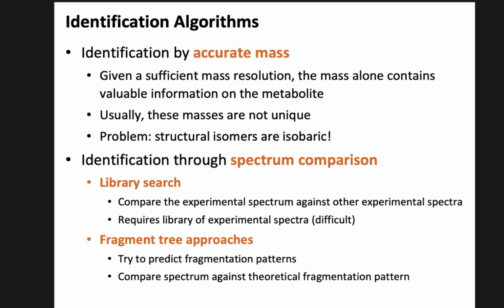And as I said, it does not mean that it's really the same compound, because these metabolite spectra can also be very information poor. There are spectra where you got 5 peaks, and that's it. And there are sometimes several structures that can lead to basically or virtually identical spectra. So there are different degrees of evidence. And ideally, you would argue, I know that the retention time is correct. I know that the parent mass is correct. The spectrum looks more or less the same. I've validated it through a spike in. It actually pops up at the same position, increases the height. I've done NMR. I'm a true believer in this identification.